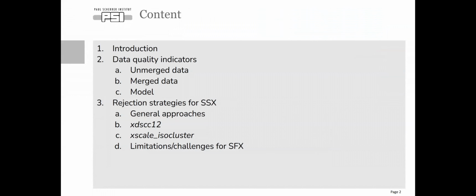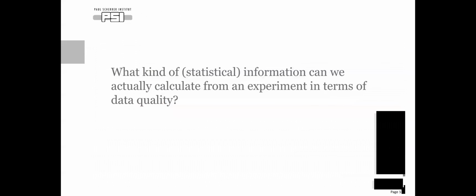So I will have a small introduction and then cover some data quality indicators that I think are useful for, as Graeme already said, crystallography. Obviously, I cannot cover everything. And then I will go to my second part and talk a bit about approaches for rejection of bad data sets.